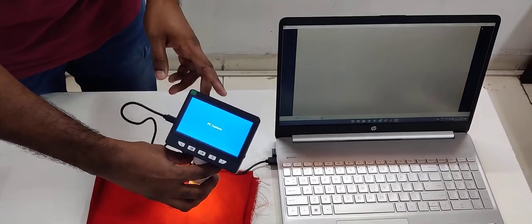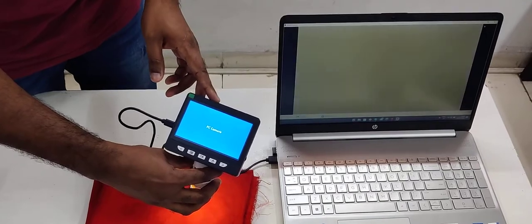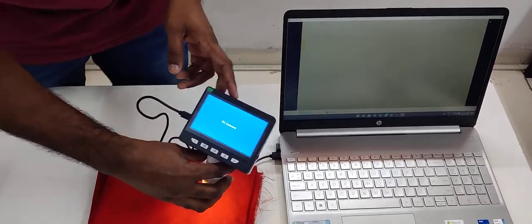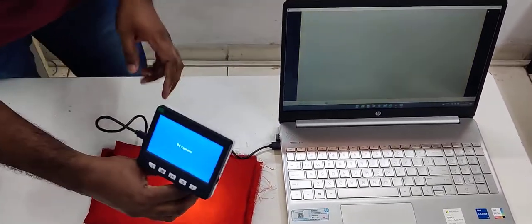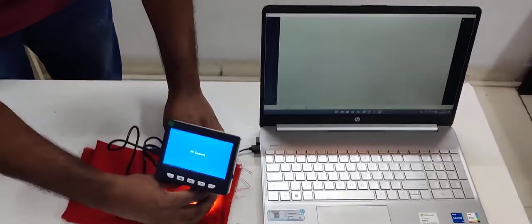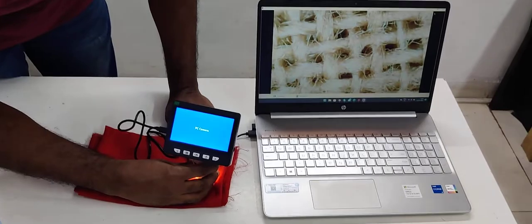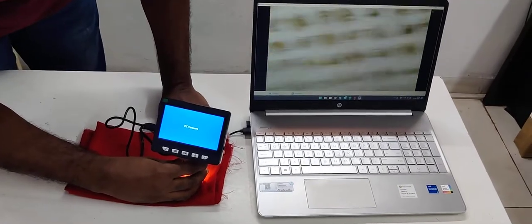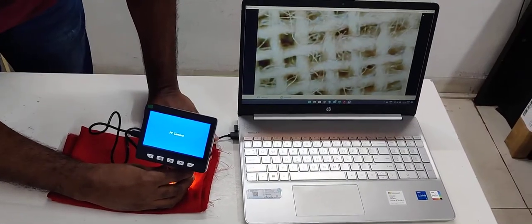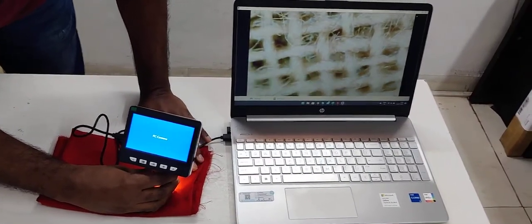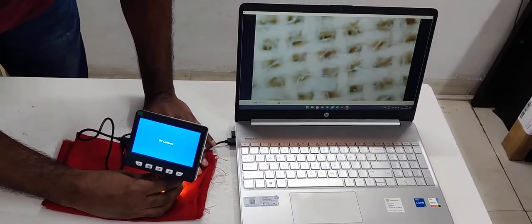After selecting PC camera, just keep the microscope on a fabric. The same live video you can see it on a system.